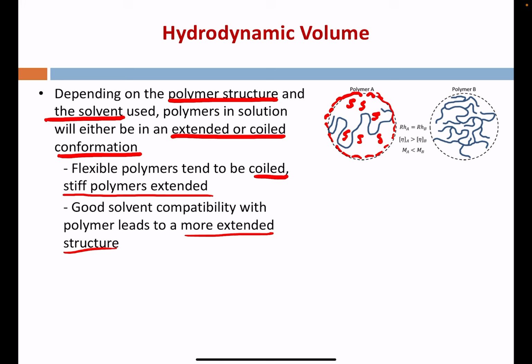A different polymer, perhaps with more branching, more structure per repeat unit, can have the same hydrodynamic volume, but more macromolecular structure within it and less solvent to occupy that same volume. So here polymer A and B have the same hydrodynamic volume, but would have different properties.